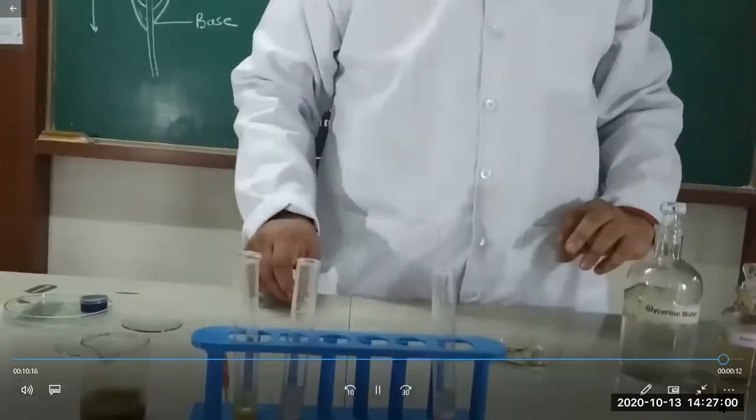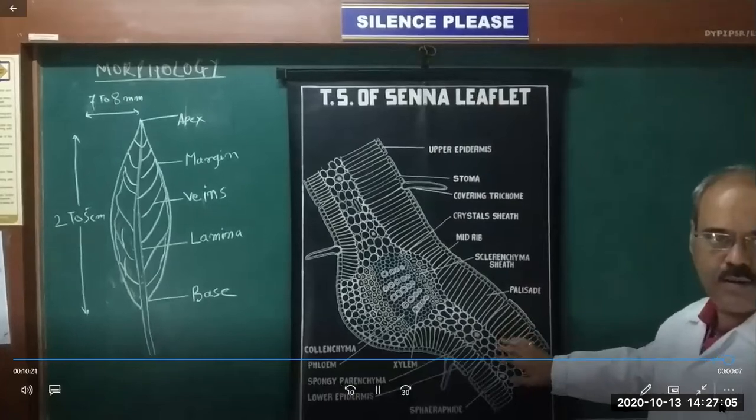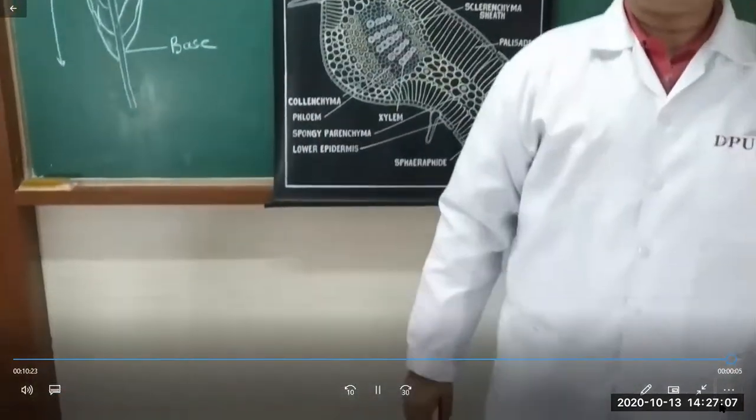So today we have discussed the morphology, microscopy, and chemical test for the senna leaf.